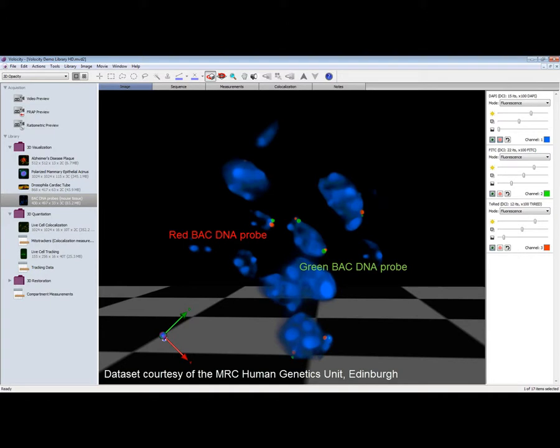In areas of tissue where the gene of interest is transcribed, the chromatin is reorganised, which results in an increase in the distance between the two probes. This distance is therefore used as an indicator of expression of the gene of interest. Here we will create a measurement protocol to measure, in 3D, the distance between these probes.